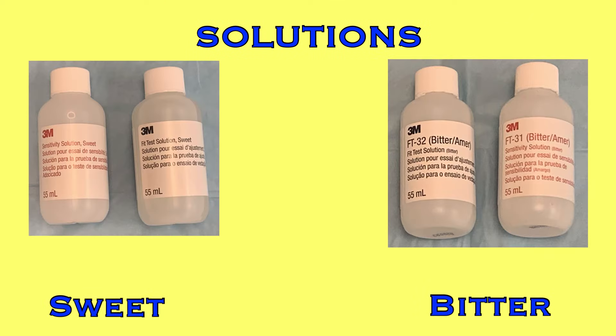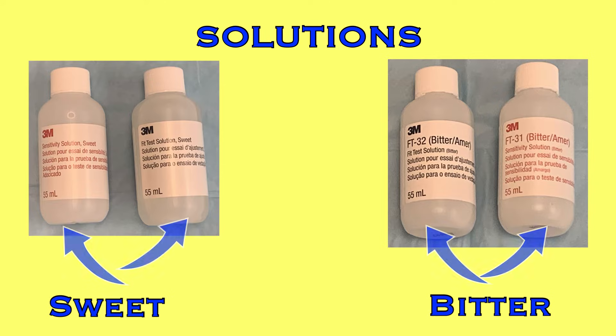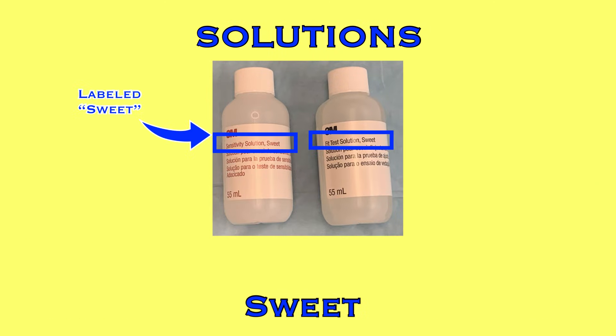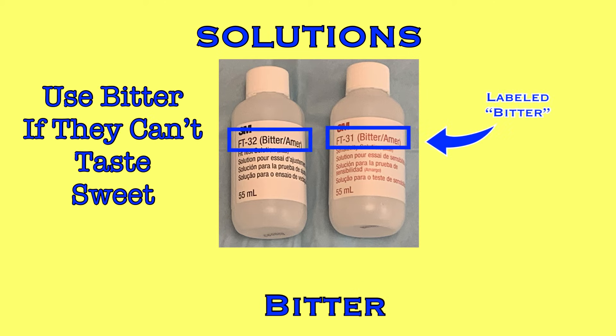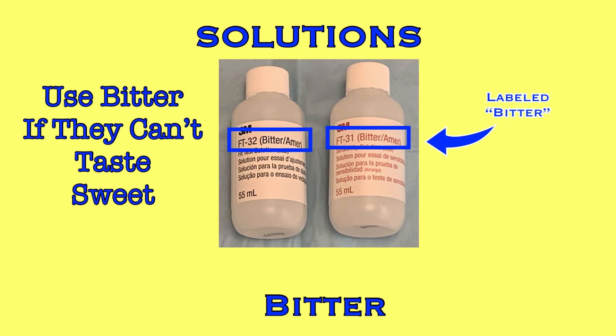You'll also need fit test solutions. Qualitative fit tests are completed with either sweet or bitter solutions. Sweet is the initial solution that will be attempted for most, if not all people. It is a sugar solution that will be aerosolized around the colleague's face. If they are not able to taste the sweet solution, which will occasionally happen, then a bitter solution can be used. The bitter solution can be tasted by almost everybody, but it's not a pleasant taste, so it's not the preferred solution for fit testing.